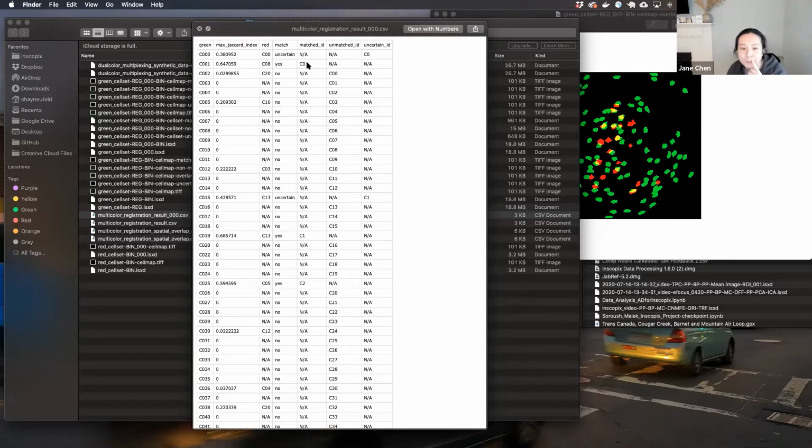Anyway, that was a minor point. But the other question I had was how it determines which cell to match it to. If you have 3 green cells that are next to each other and 2 red cells in that vicinity, you're going to have different iterations of it comparing that 1 red cell to the 3 green cells that are next to it.